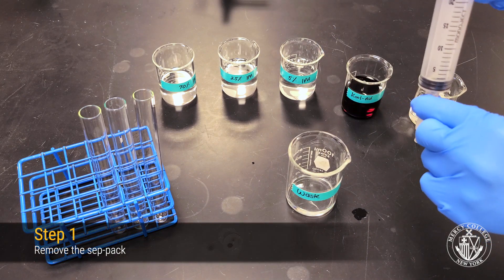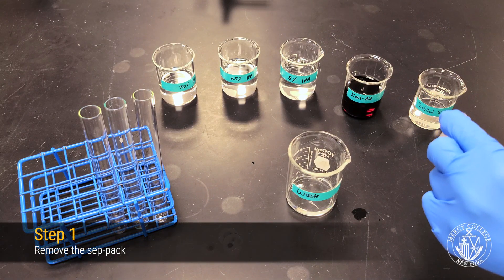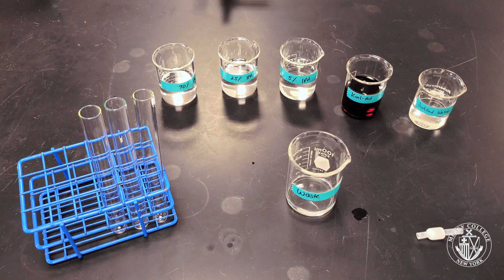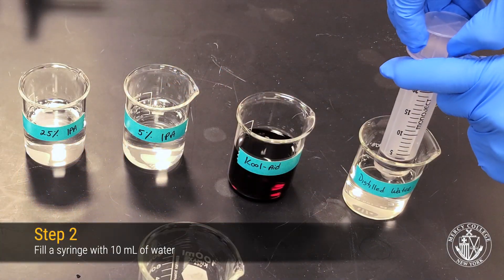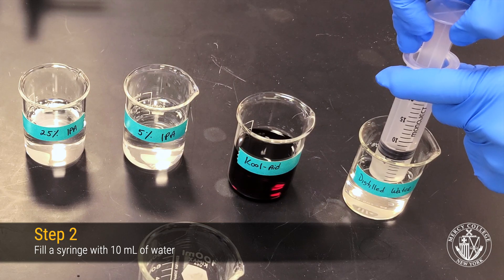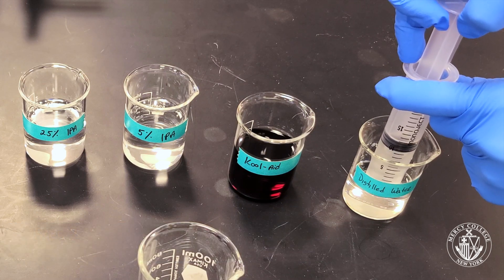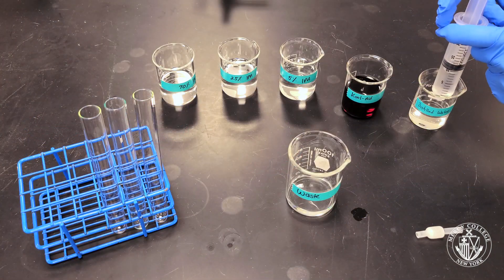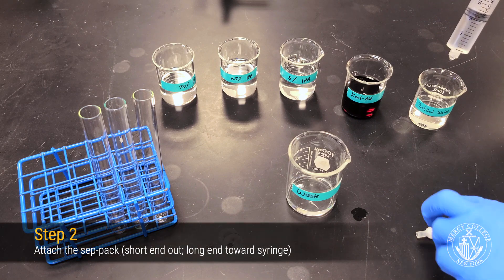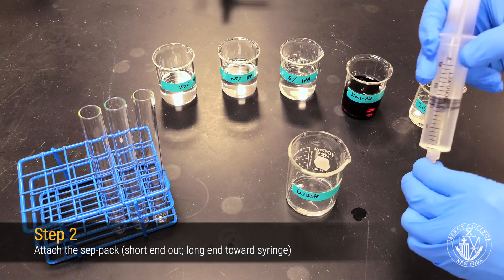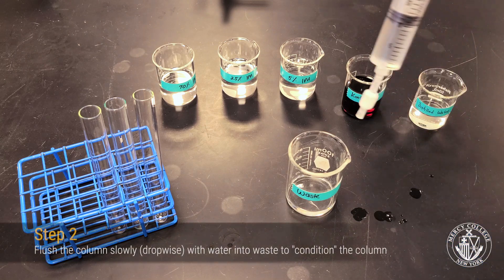Now remove the CEPPAC cartridge and refill your syringe with 10 mL of distilled water. We're going to use the water to condition our column since our Kool-Aid mixture is also dissolved in water. Now reattach the CEPPAC column to the syringe and slowly flush the syringe with the water drop by drop.